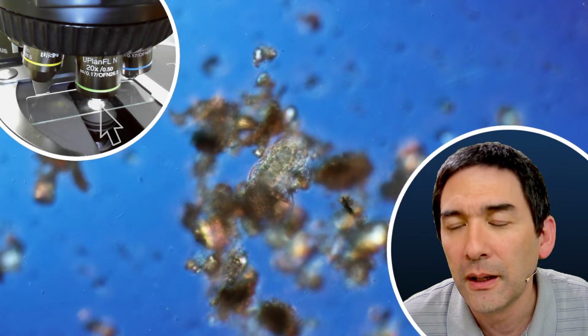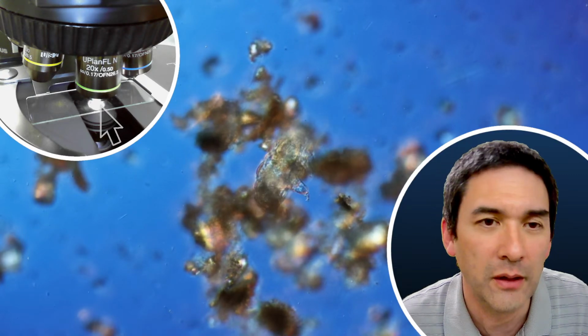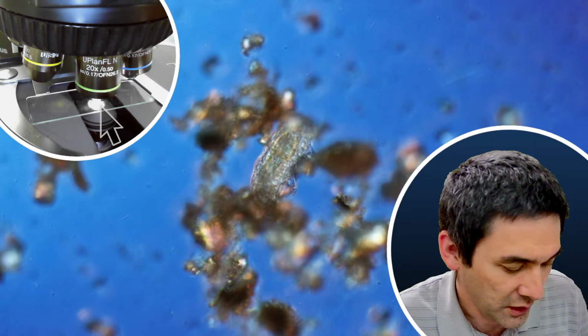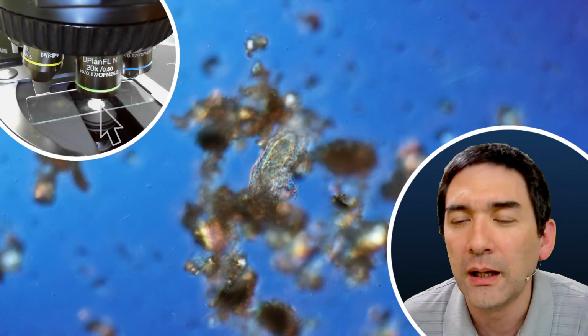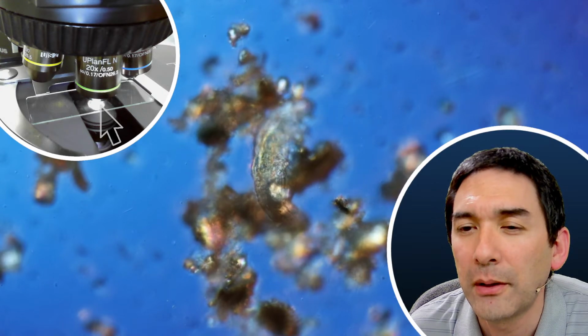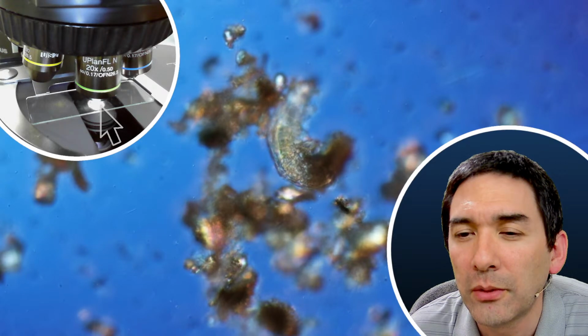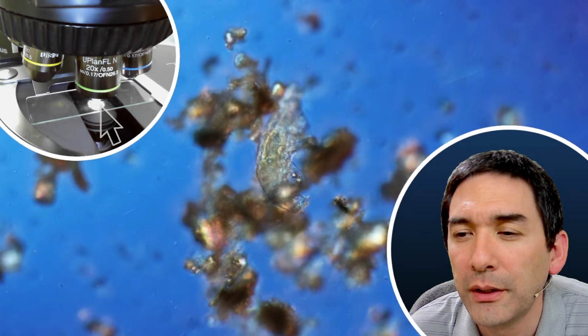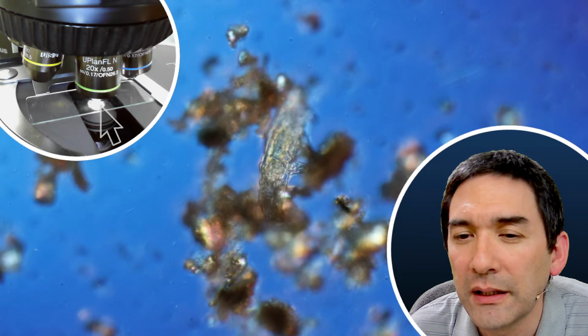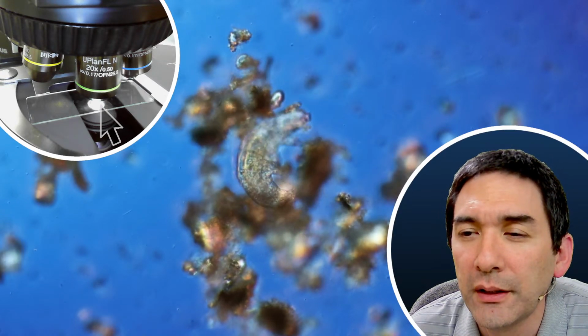Okay. Yeah, so I'm going to go through again some of this, as we have a look at this one over here, and then I'm going to show you the short video. Some tardigrade types are in the ocean too. Yep, that's what I was talking about, heat. Okay, I'm talking about survival. Even though they are pretty tough on heat, they don't like heat though. At least that's what I read somewhere. Okay, then we found the tardigrade.